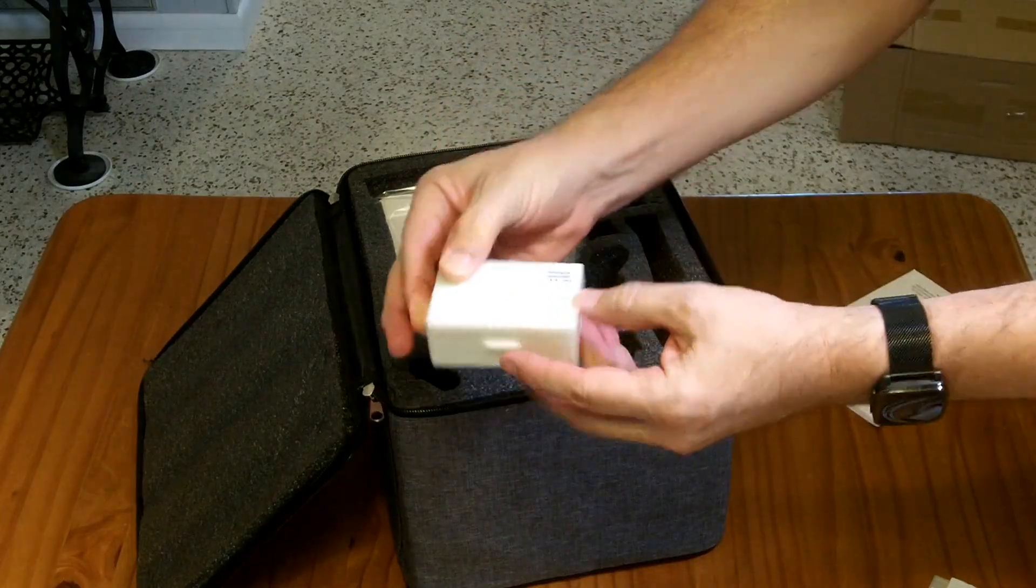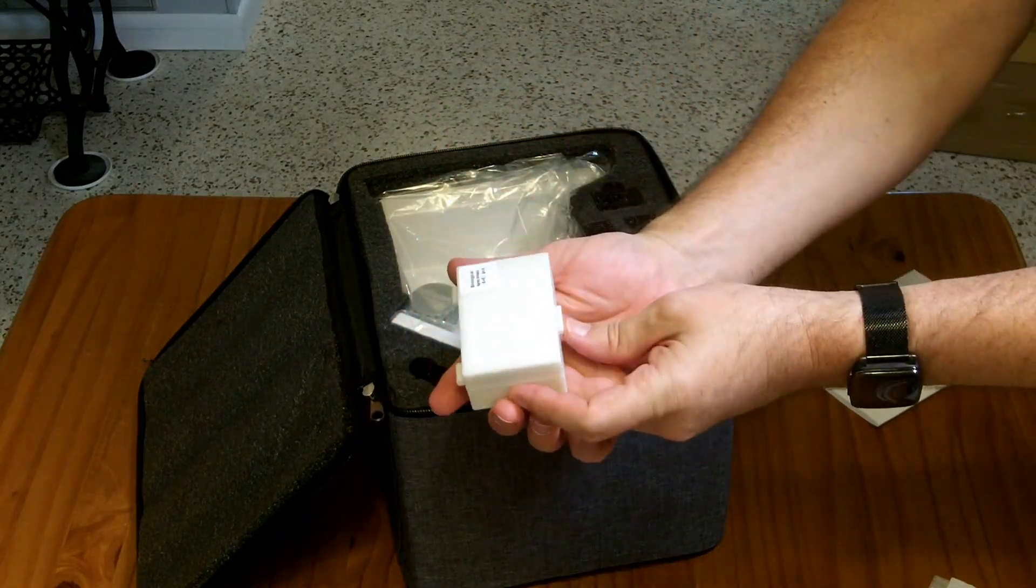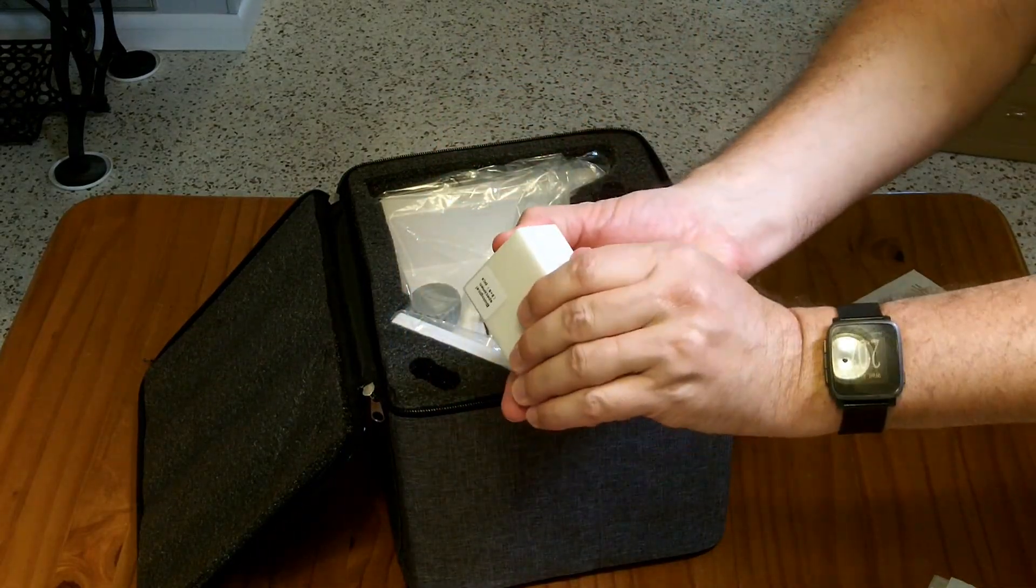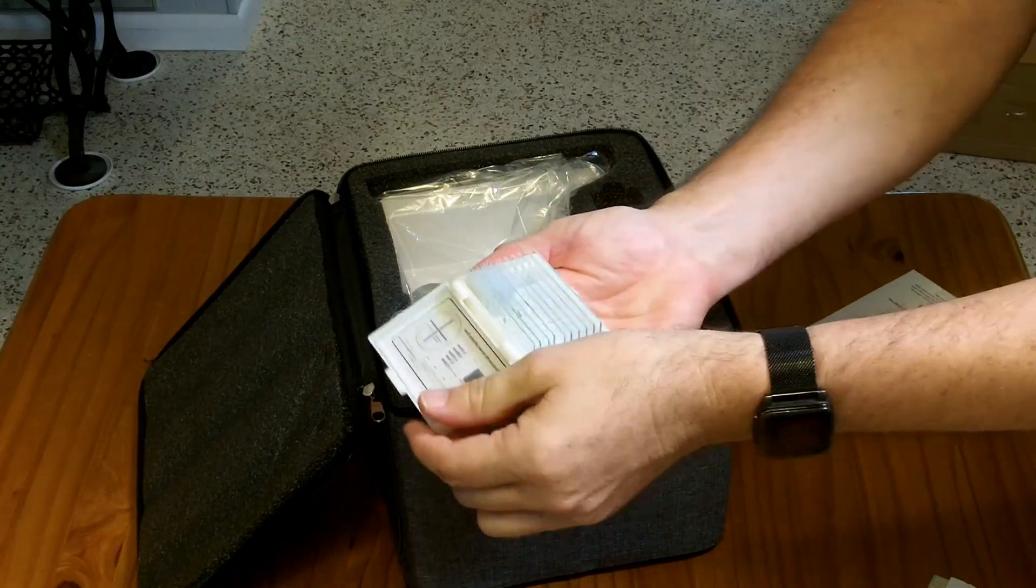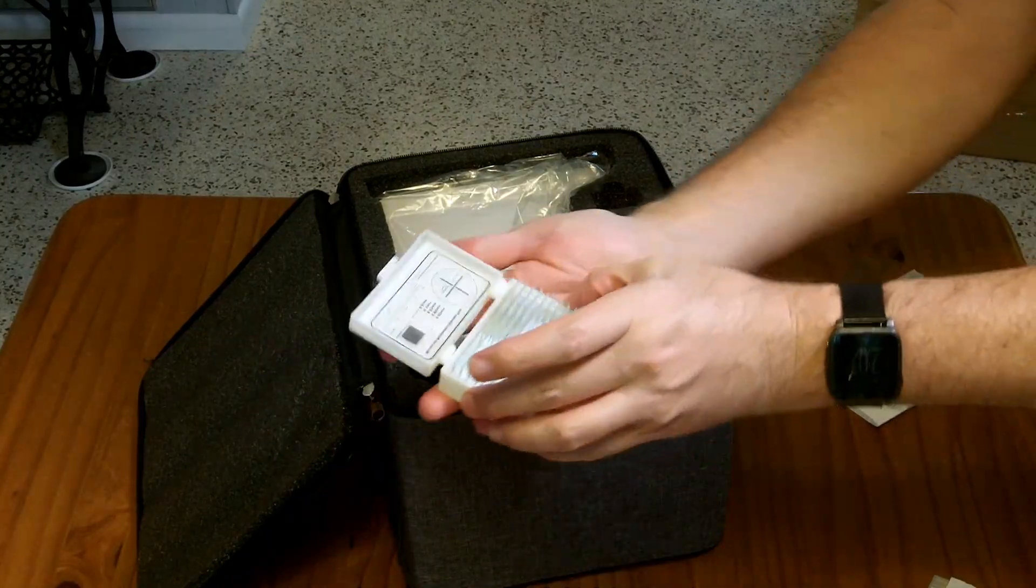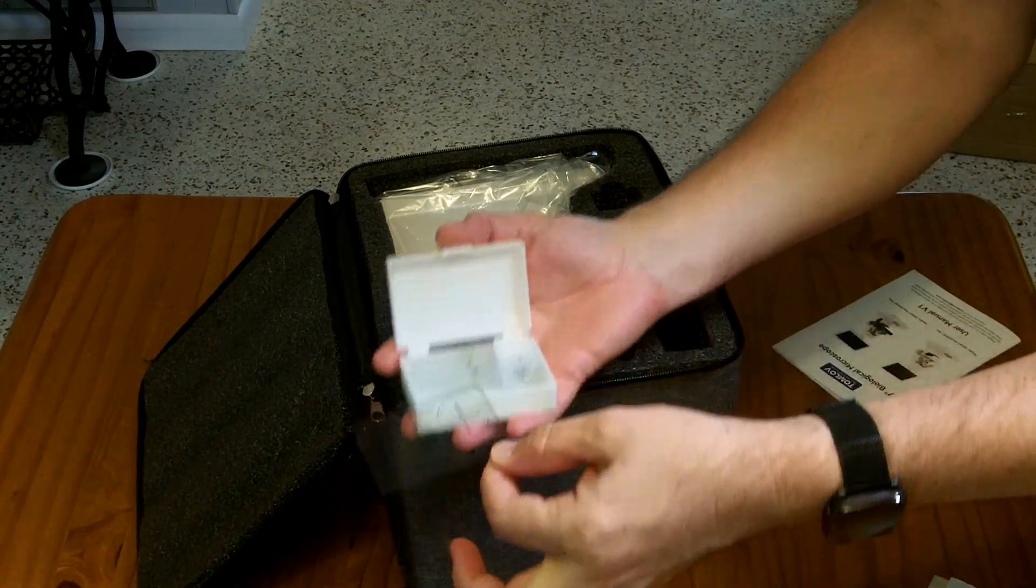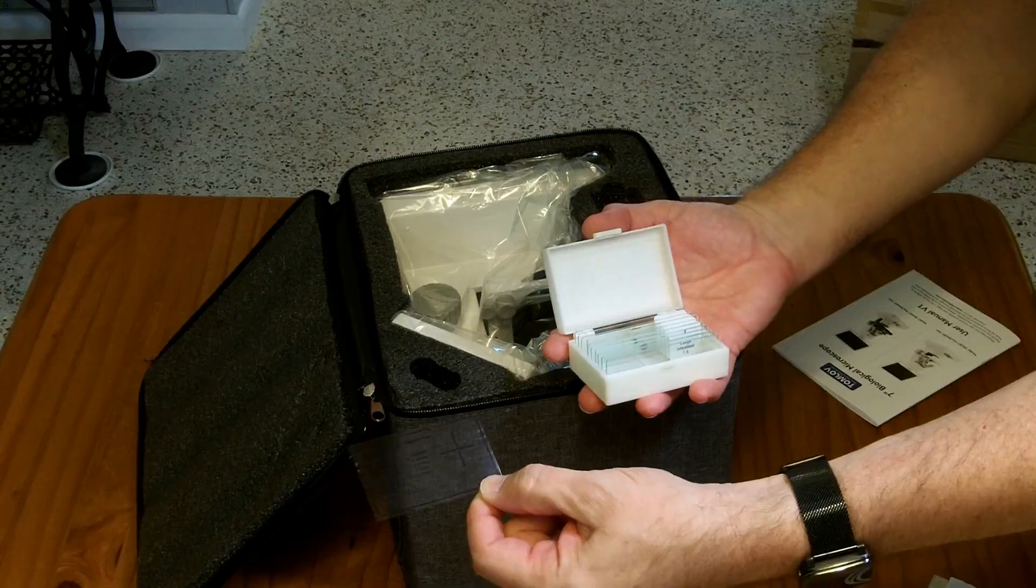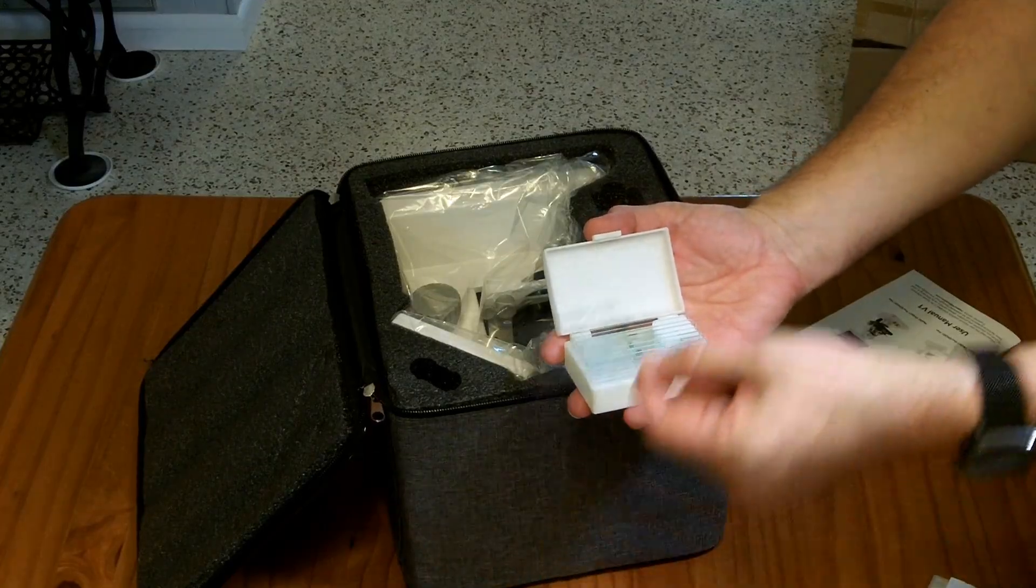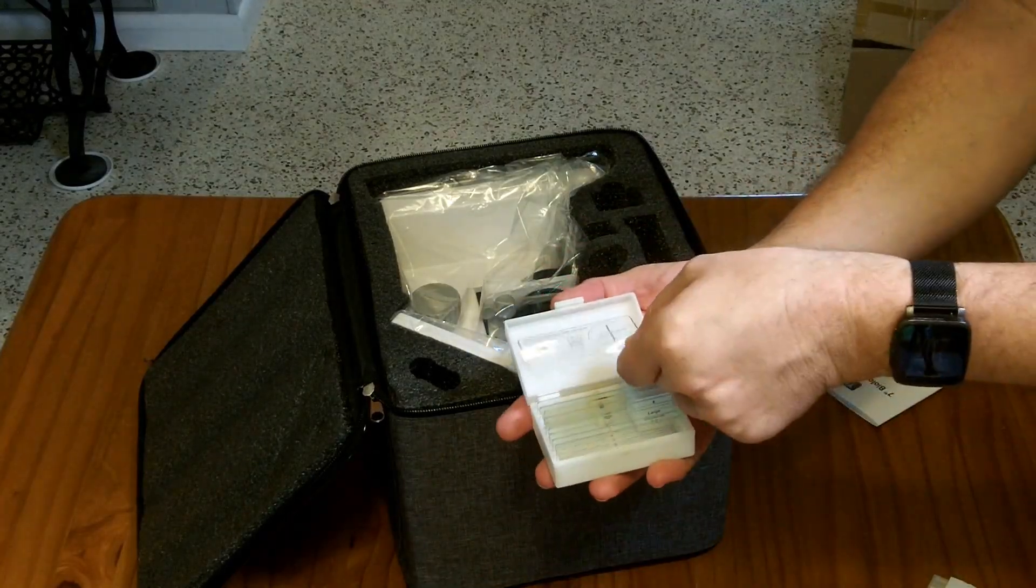We have a box here of biological specimens, 5 plus 5 pieces. So these are example slides with things already on them. There's also this clear gauge for calibrating the size gauge on your system at different magnification levels.